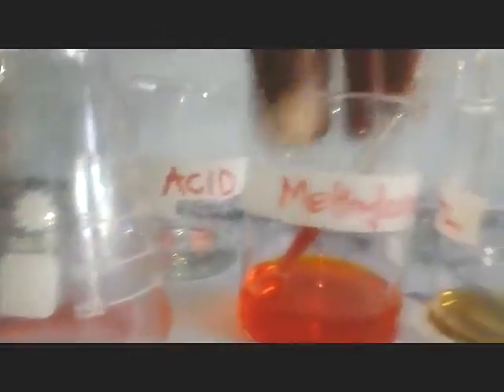Now when you compare the three, this one is the real color of methyl orange. This one here, try to look at it. Now in this one, we added a base. Try to look at this one. We have a base there. Then in this one, we have an acid.